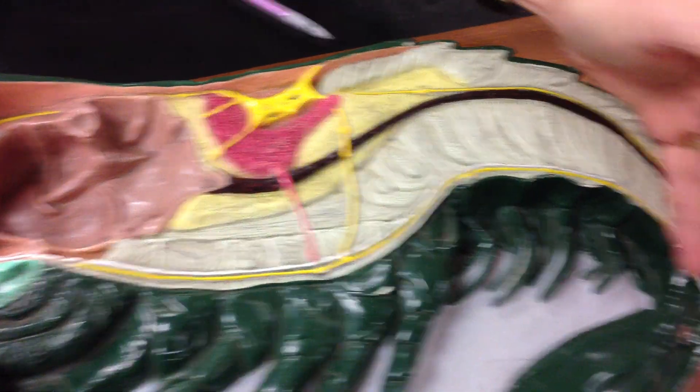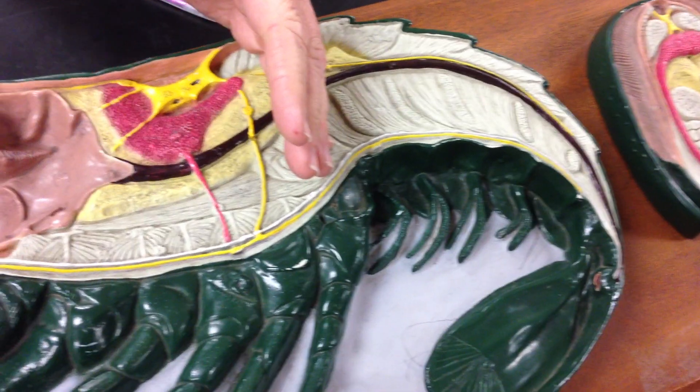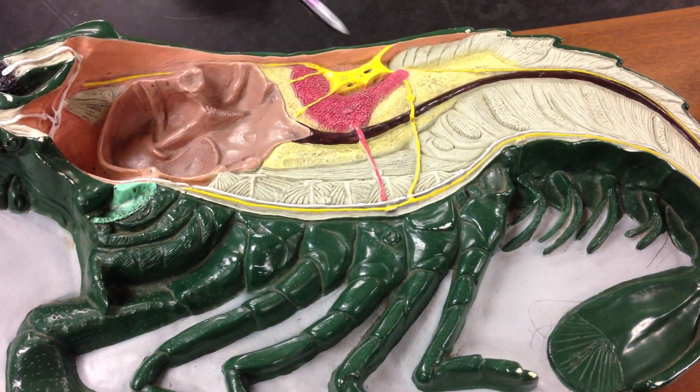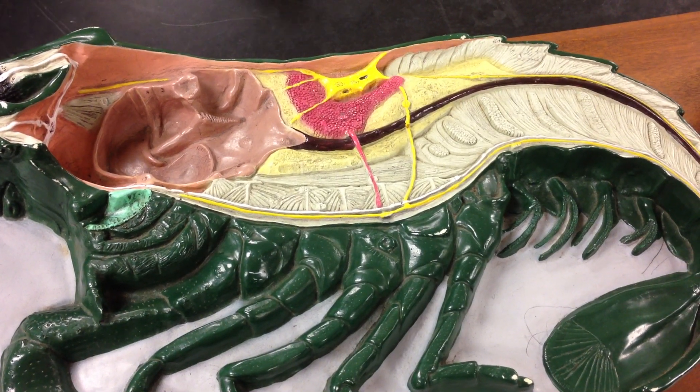The part of the body that starts here and goes posterior is referred to as the abdomen or the opisthosoma. The part of the body that goes anteriorly from that point is referred to as the cephalothorax or the prosoma.